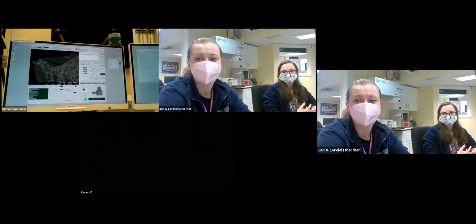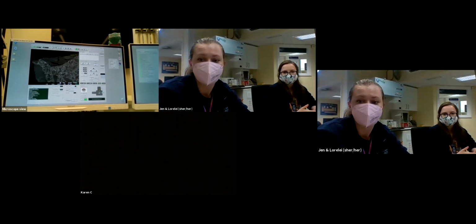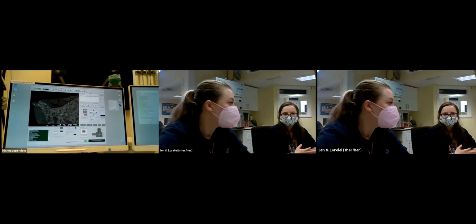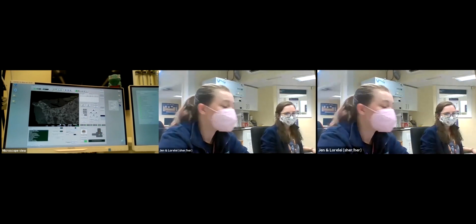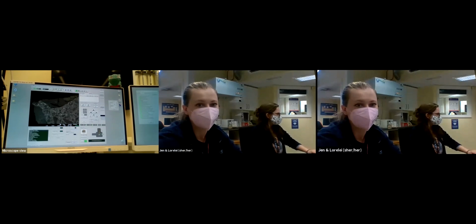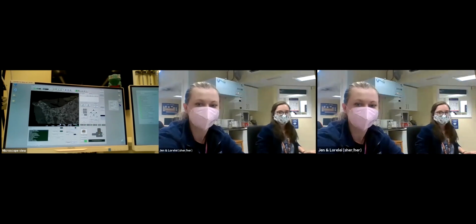Yeah, so if you do have any questions or anything, just drop us a message in the chat or raise your hand and we will get to you. We'll answer as best we can. So Lorelei is going to give us a quick introduction to our microscope today, and then we'll start doing some science, I guess.